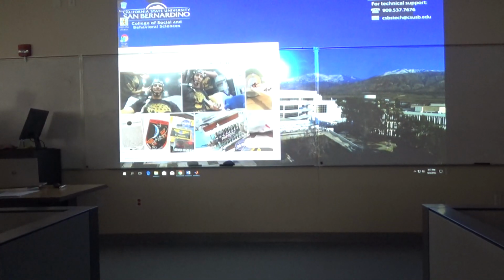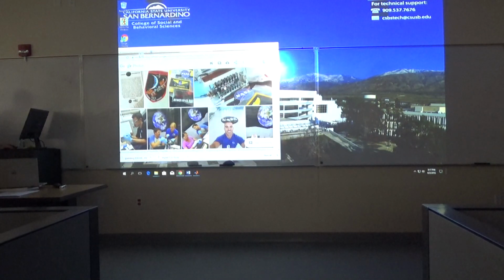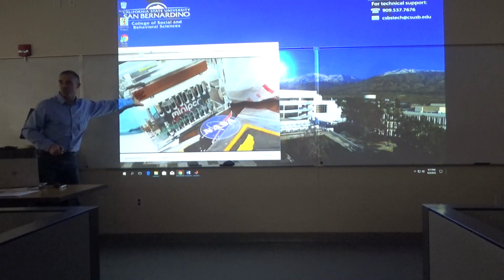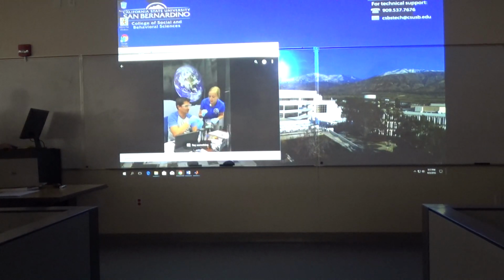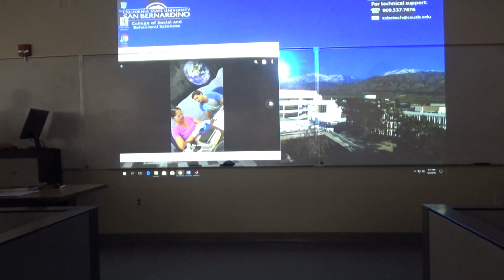Okay, let me see. Any of you guys like genetics in here? Genes? Biologists? Yeah? So this is mini PCR. You guys know what polymerase chain reaction is when you're trying to replicate DNA? That's what we're doing here. This is a mini PCR machine, and during our training we're getting trained to collect DNA samples and then to replicate them using PCR. And that's what Reinhold is doing here in this Petri dish. And then she's instructing Commander Haugen on how to do that, and Shelley's kind of showing Paul as well.